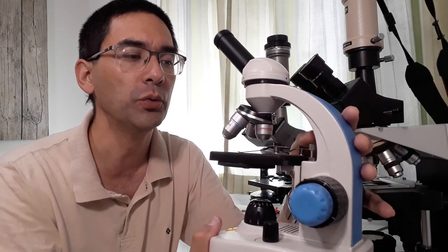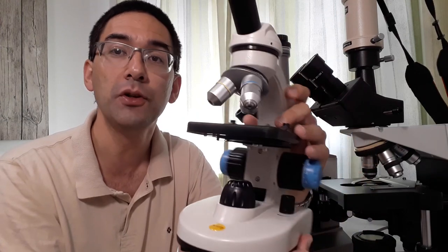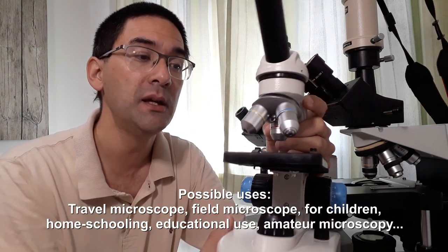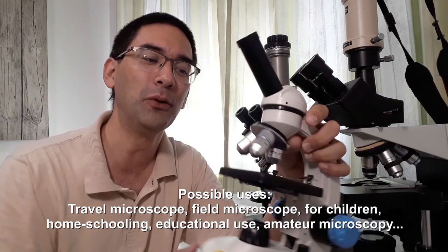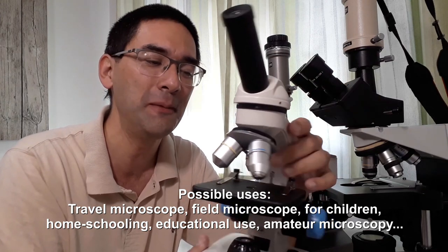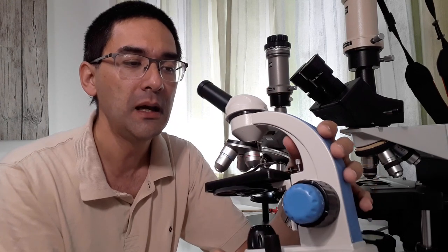Homeschooling, I can imagine, would also be another possibility here. I can also imagine this to be a very useful field microscope, especially because of the portability and the fact that you can use batteries. So theoretically, what you could do is take a camera and a laptop along with the field microscope, and then without actually being connected to a power source, you can actually do microscopy. So there are, I think, many uses for this.